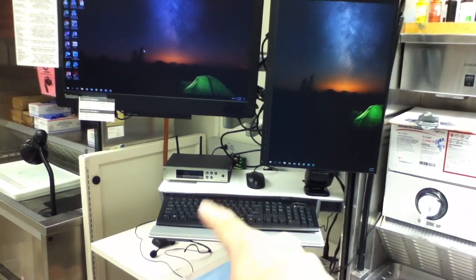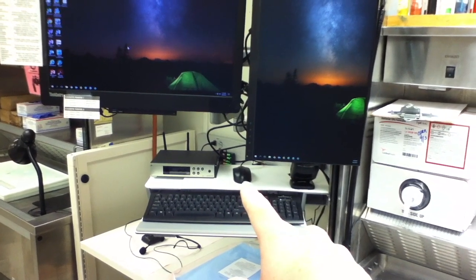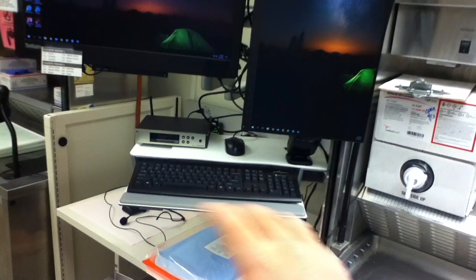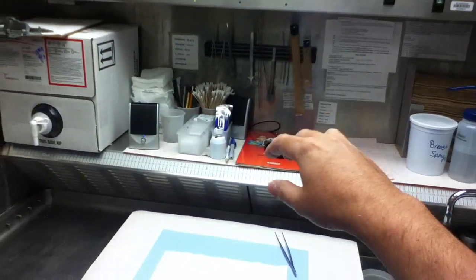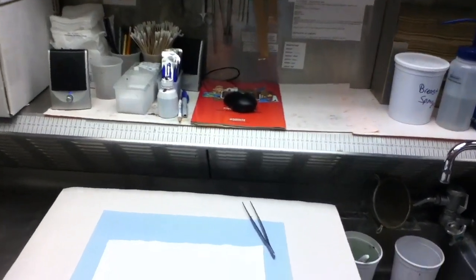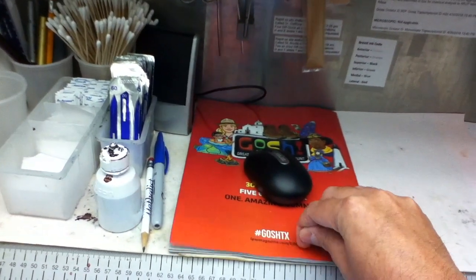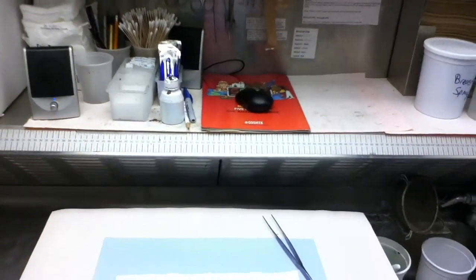I use SoftPath, and I have my block information on one monitor and my dictations on the other. I'm using Dragon, so I have a wireless headset receiver and the headset sitting over there. The wireless mouse also works alongside it — so wherever I am, if I'm at the PC I can click and type, and if I'm over here grossing with dirty hands I can use this mouse. I have an old magazine underneath as a disposable mouse pad.